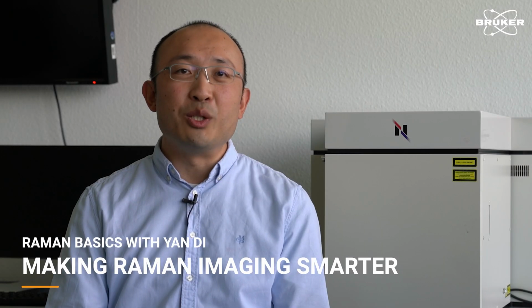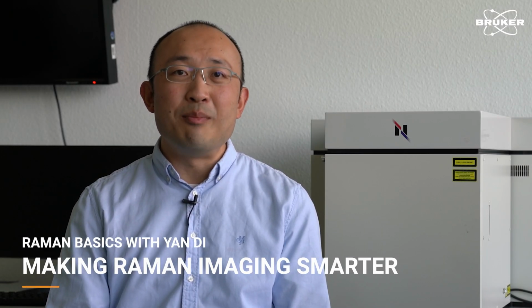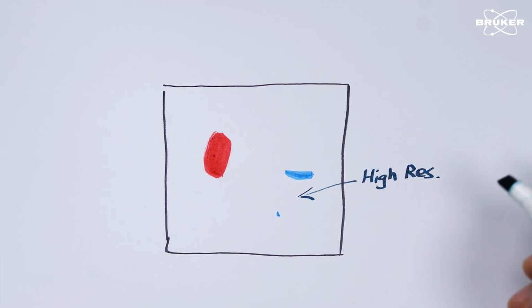In our previous videos, we explored ways to speed up Raman imaging by reducing the time needed for each measurement point. Today, let's talk about a different approach: cutting down the number of points we measure in the first place. When you are doing research, some areas of your sample are critical, where you need a small step size and high-resolution imaging. Some spots, like empty parts of the substrate, might not even be worth measuring at all.